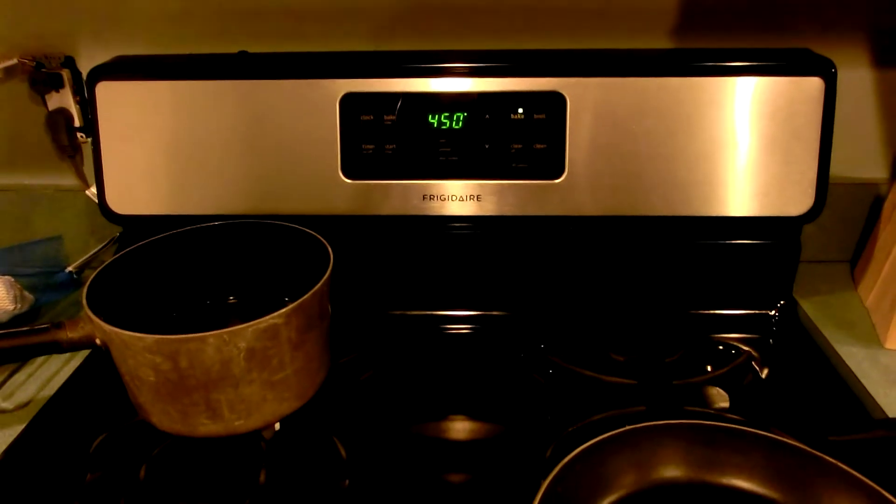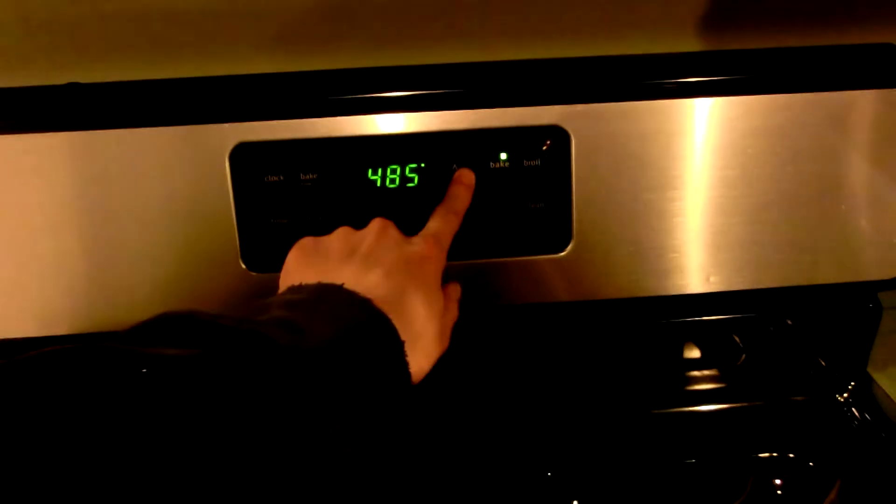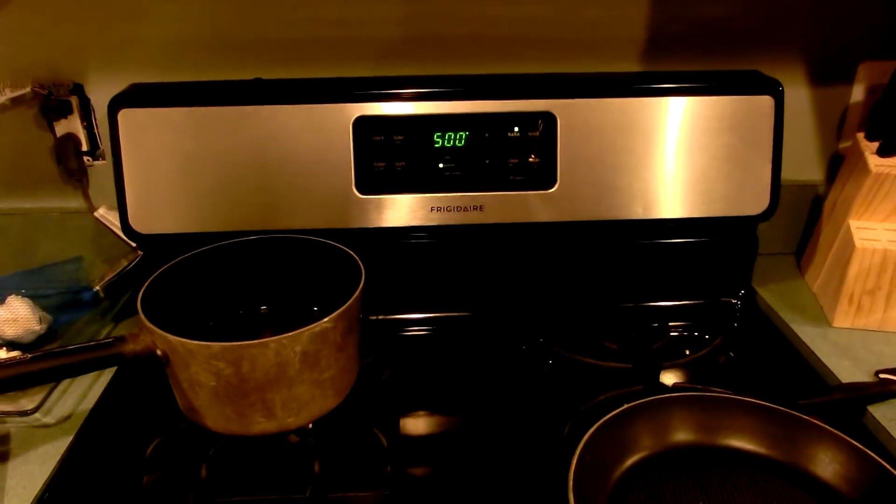So now it's been an hour. We're going to up the temperature to 500 degrees to make sure everything is absolutely dry, and wait one more hour. Then we'll come back and crack it out of the pan.